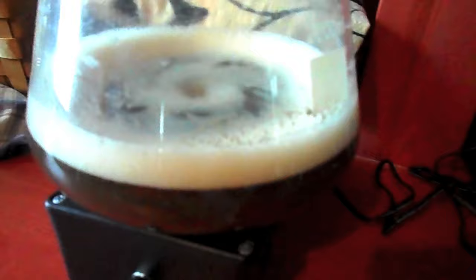Here we are, about 24 hours out after pitching. You can see there was already some krausen forming here. Stir plate's going. I actually had to move the stir plate to another spot just because it was in the kitchen, which kind of is a nuisance being in there. But everything's going, seems to be working just fine. A fair amount of yeast there. We'll see what happens in a day or two.